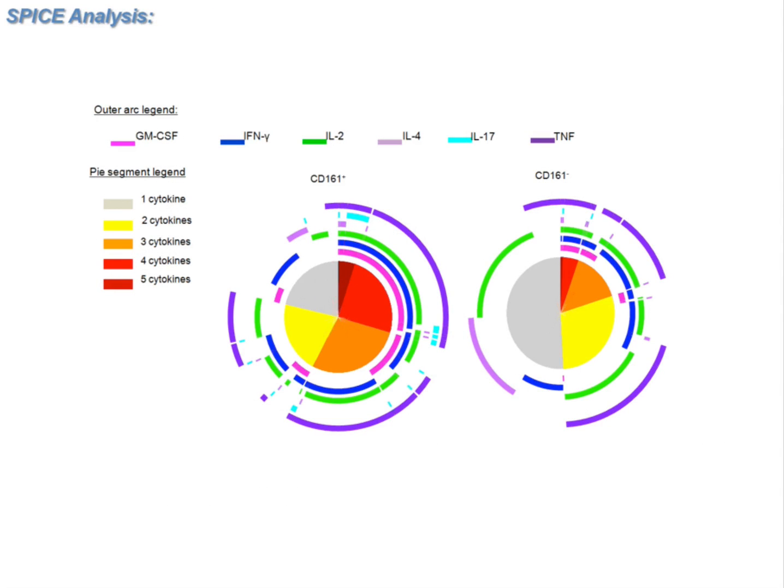And then I've just put in this also, you're probably used to the various analysis softwares, or how we interpret the data post-acquisition. In particular with intracellular cytokine staining, SPICE software is a nice way of presenting this data. We're looking at possibly the differential expression of a lot of different cytokines within one cell.